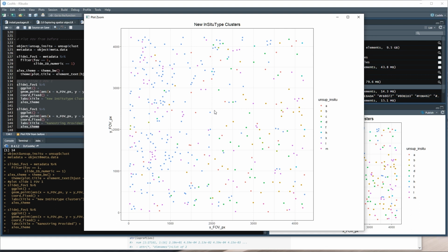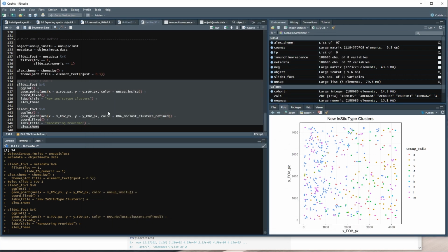But without knowing the tissue, I'm not 100% sure what to expect. It looks like there's also green down here. But we are getting that separation, right? So they provided labels that put a cell type upper right and bottom left, upper left and bottom right, and we're also seeing the upper left and bottom right for our clusters as well.